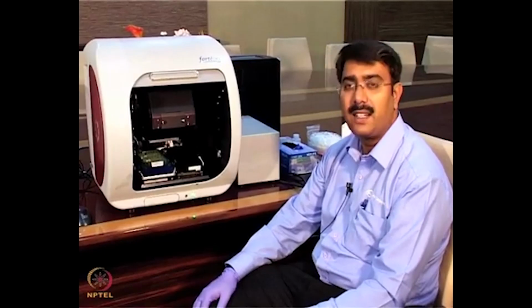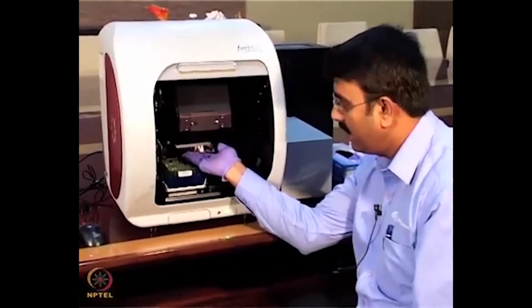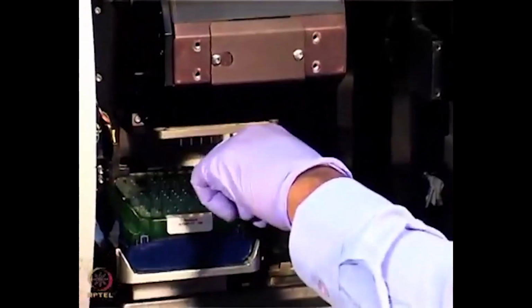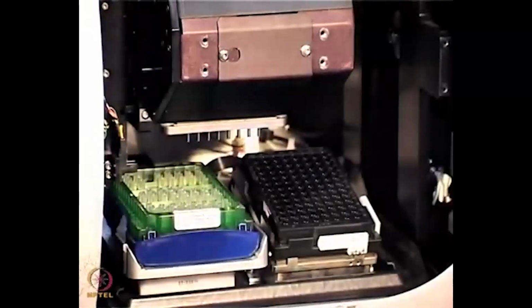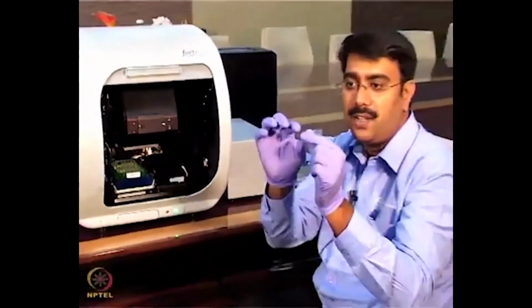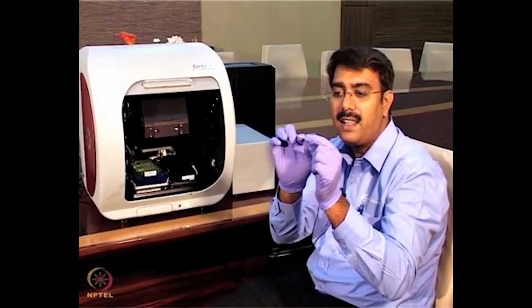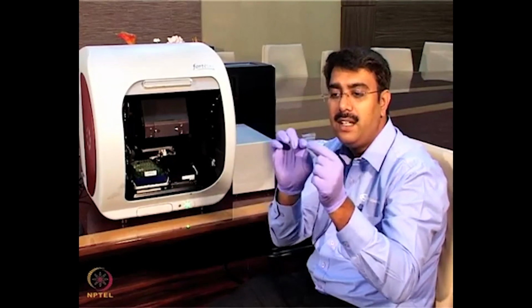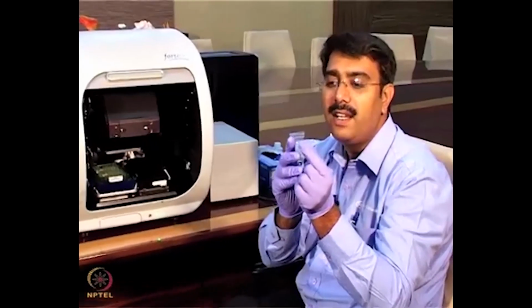Here it consists of a white light, as you can see, and this is the light emitting diode. We are passing the light from the light emitting diode through the sensor. This is the sensor. It is actually made of glass. It consists of a fiber optic inside, and the holder part at the end is made of plastic, so inside there is a fiber optic. At the tip of the sensor we put the ligand of our interest.